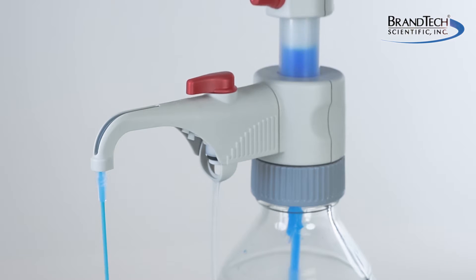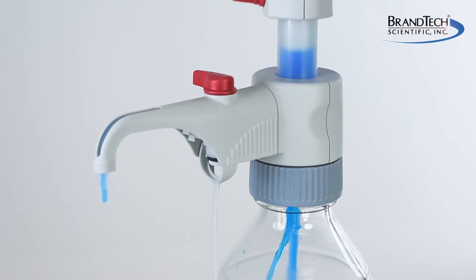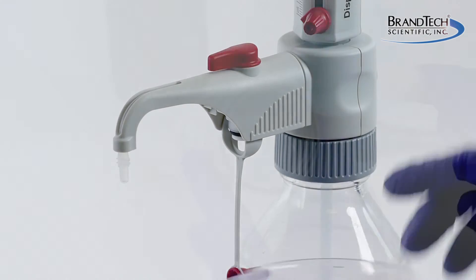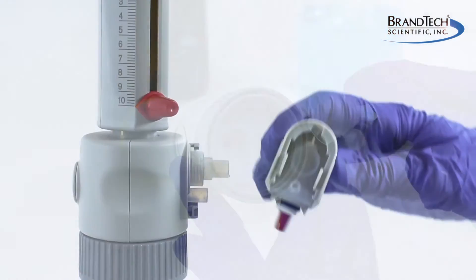The Dispenset S incorporates many new features including an improved recirculation valve, a hinge safety cap, smoother and lower force operation, an improved safety discharge system, and a washer-free sealing system.